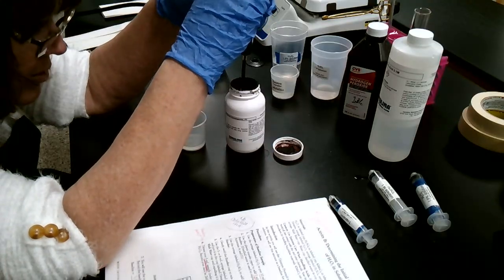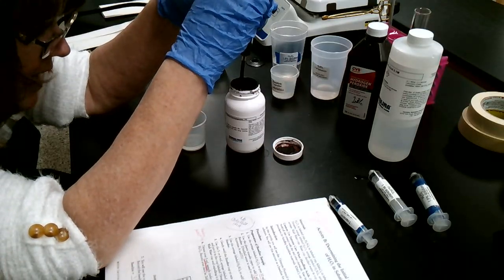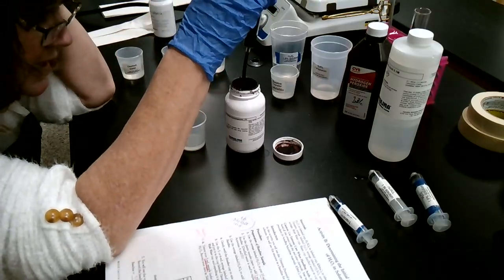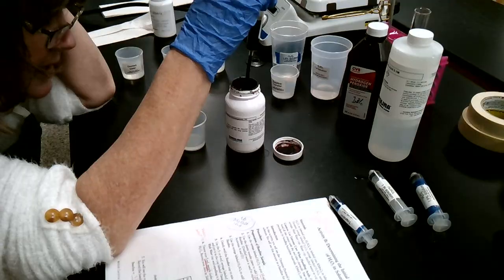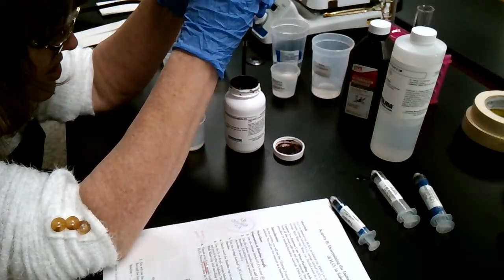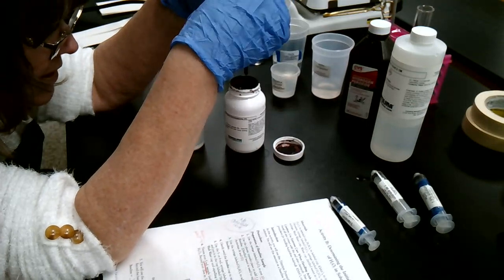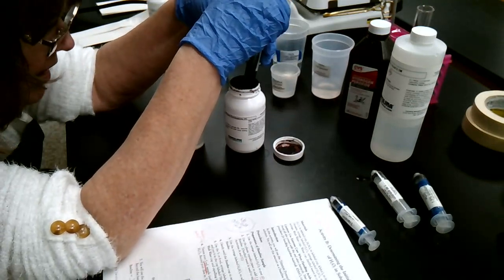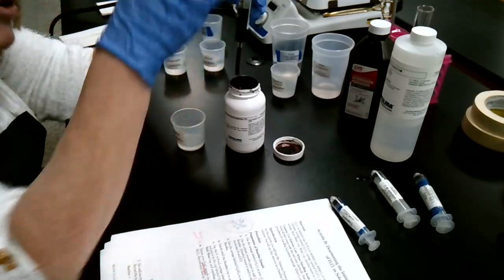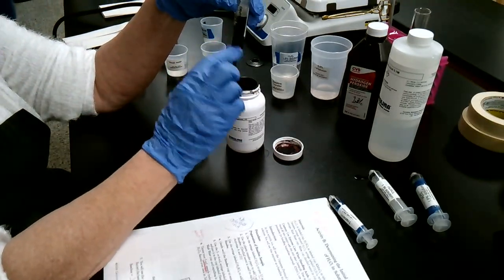Then you squirt it down until you get to that 5 milliliters. It's very dark to see this, so you've got to be exact. I like to start right at 5, though I went a little bit past 5, which I did. I'm sorry, I'm going to be picky here. If you go a little bit past 5, just write that down as your initial volume.